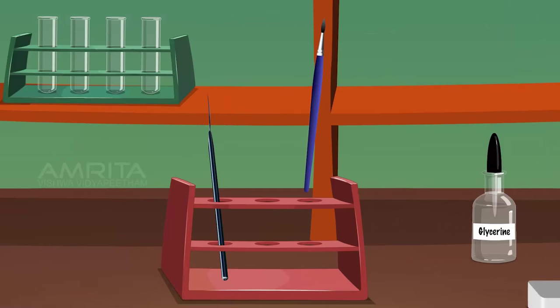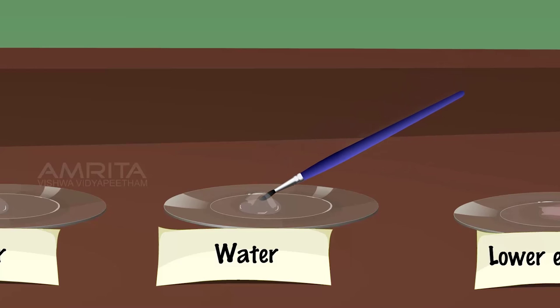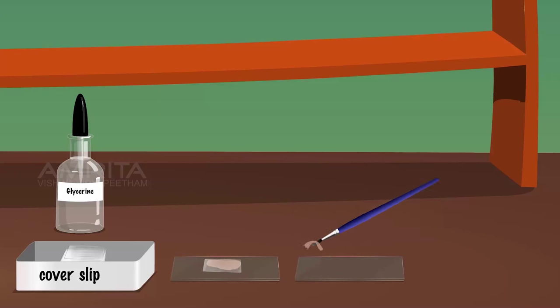Take the upper epidermal peel from the safranin solution using the brush and place it in the watch glass containing distilled water. Remove extra stain and transfer the peel onto a glass slide. Take a few drops of glycerine in a dropper and pour two to three drops on the slide. Take a cover slip and place it gently on the peel with the aid of a needle. Remove the extra glycerine using a filter paper.